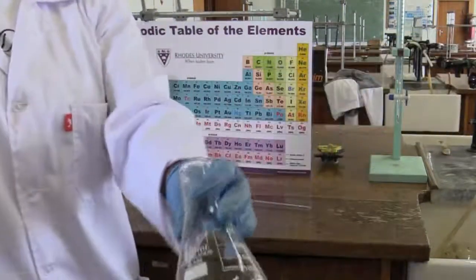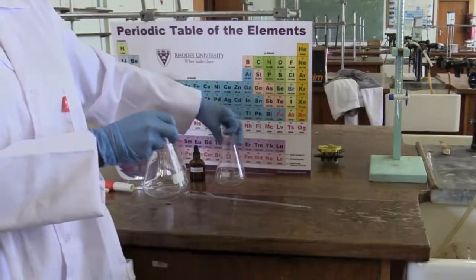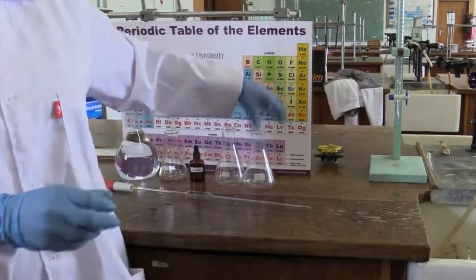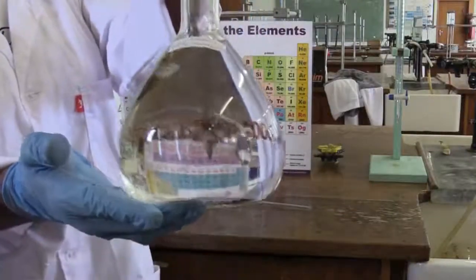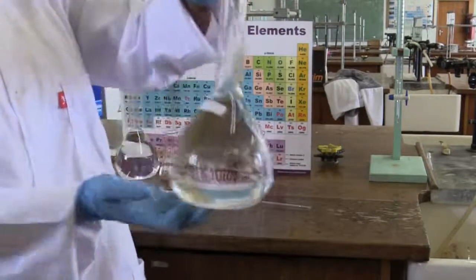2 additional Erlenmeyer flasks are required to carry this reaction out in triplicate. The next important component of the experiment is the analyte. It is a solution of sodium hydroxide and we do not know its concentration.